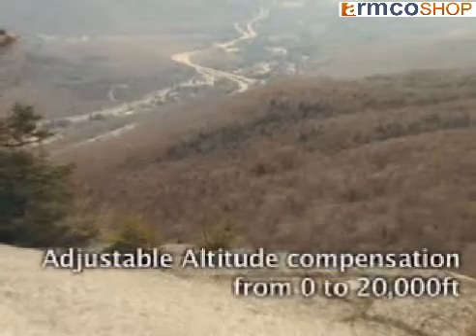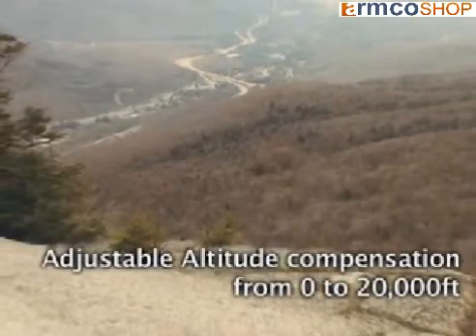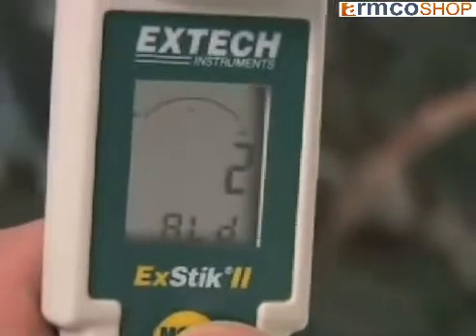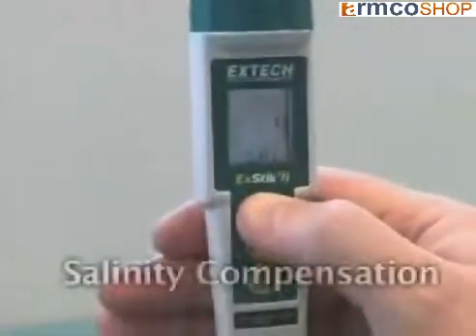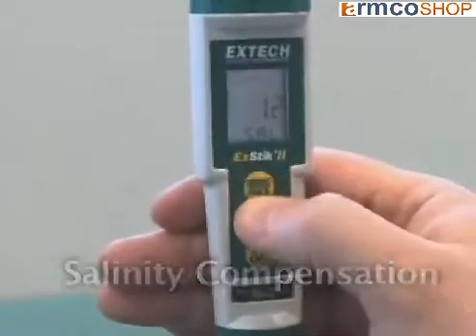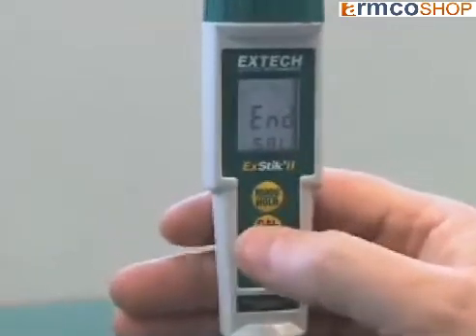Adjustable altitude compensation allows you to select the altitude in which you are taking your measurement in increments of 1,000 feet. Salinity compensation allows you to correct for the amount of salt in brackish or seawater, giving you an accurate measurement of dissolved oxygen.